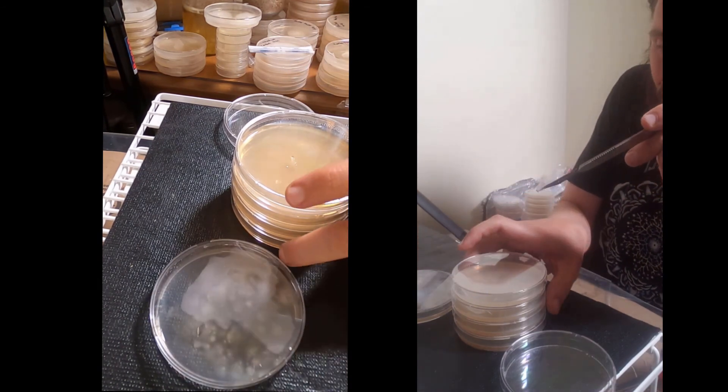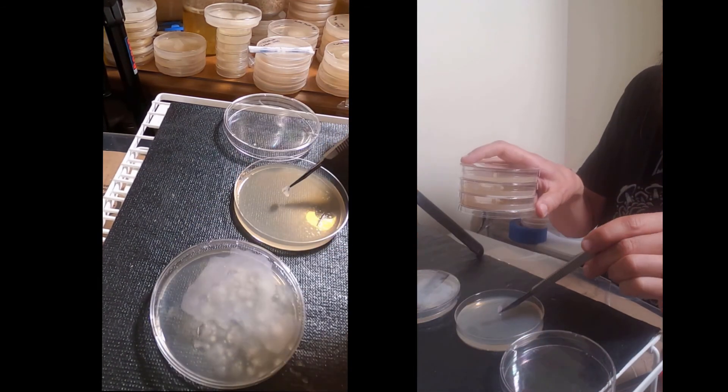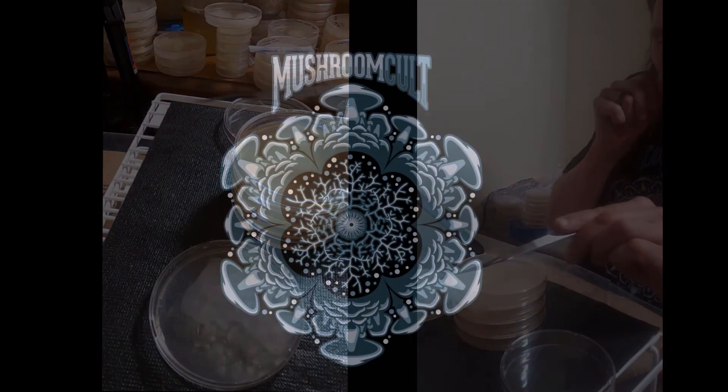Smaller the better — you really only need one cell. These are quite large pieces actually. So there I have four different colonies isolated.